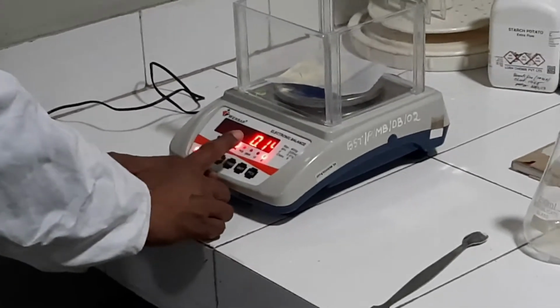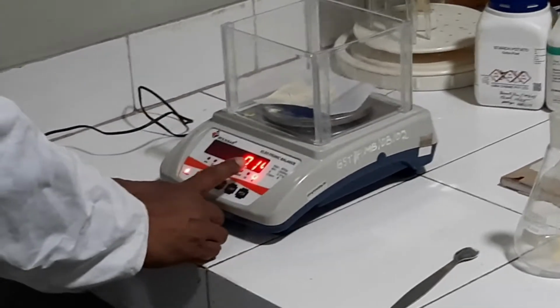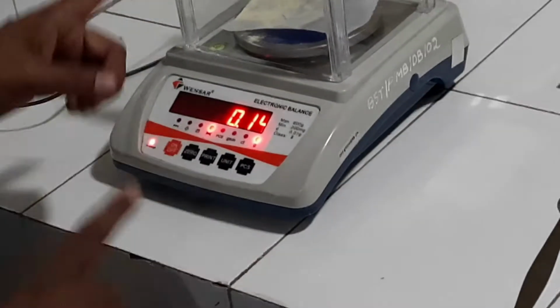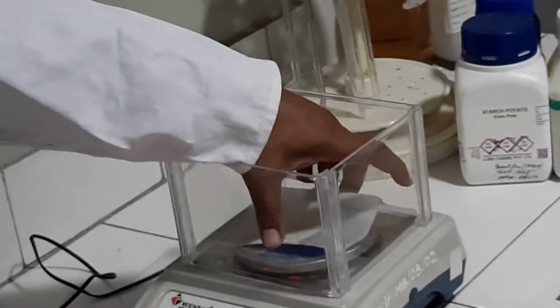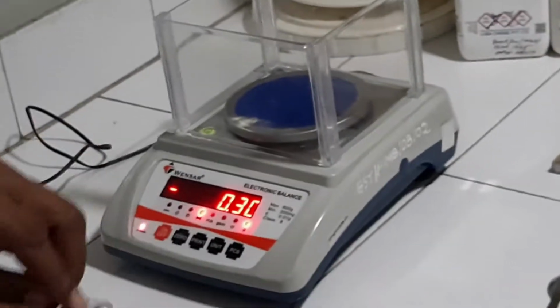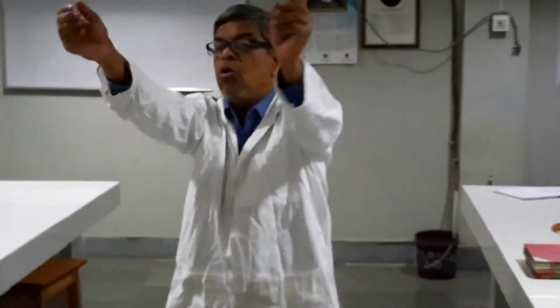You see the weight of the paper has increased by almost 140 milligram. This is due to the beef extract. So this is the primary media preparation. Now I will discard the paper in the dustbin. Waste management is another subject of discussion. Waste management should be there and you should know what to waste where in the laboratory.